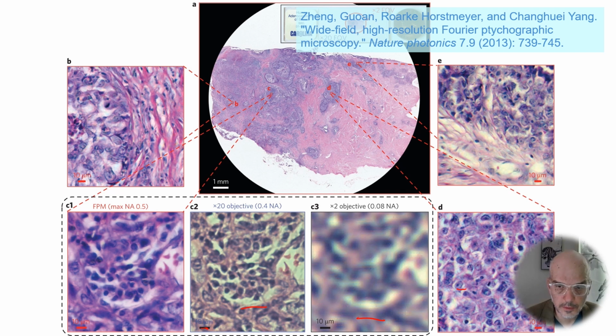So with ptychographic microscopy, we achieve two things. One is we're able to recover the coherent field, so we've got a phase and amplitude image of the field rather than just an amplitude image. And second, something that's being done here is aperture synthesis, to improve the resolution beyond the resolution you can get in a single aperture. Let's talk about how that works.